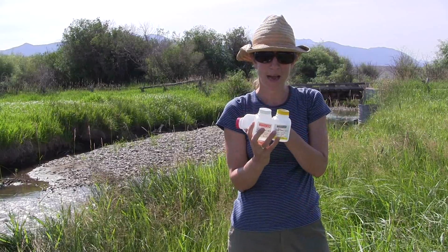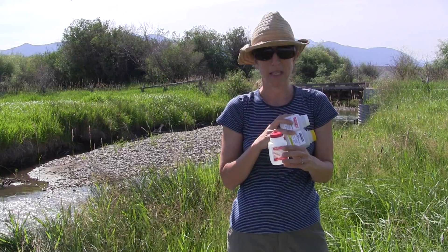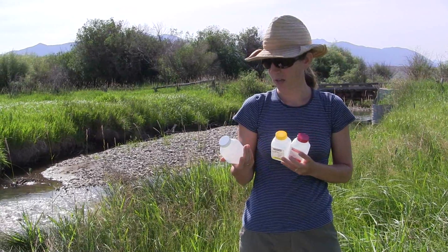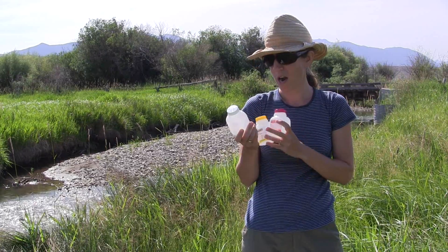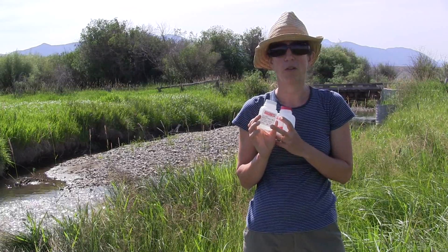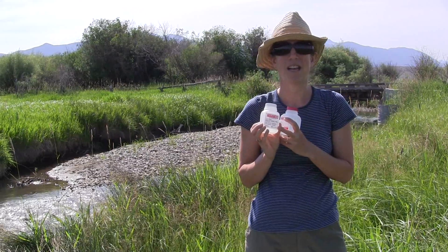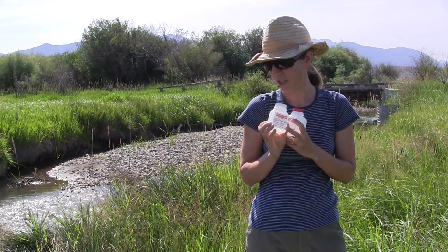Every site will have a bottle with a white cap and a yellow cap, and at certain sites there will also be a red cap bottle to test for arsenic. The bottles should come to you completely filled out except for the time collected — fill that out before you get in the creek and get the bottles wet, and make sure it matches the time on the site visit form for your site.